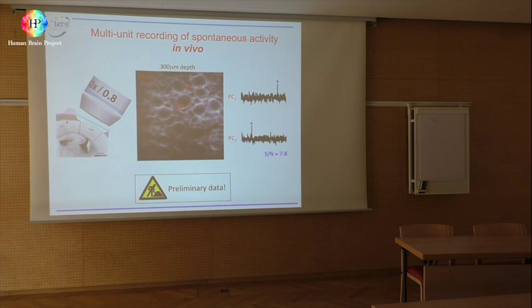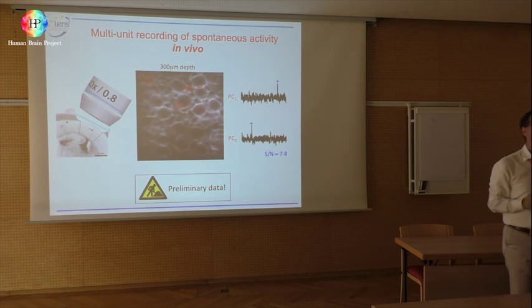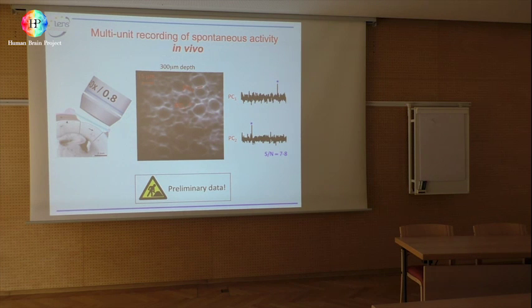While if you go the superficial way, you lose the resolution, but you can maybe see 100 and 100 of cells in parallel. So it's a complementary technique. It can be used if you want to study a few neurons' behavior in some kind of task. It's not useful if you want to image an entire part of the brain, because that's not possible with this kind of technique.